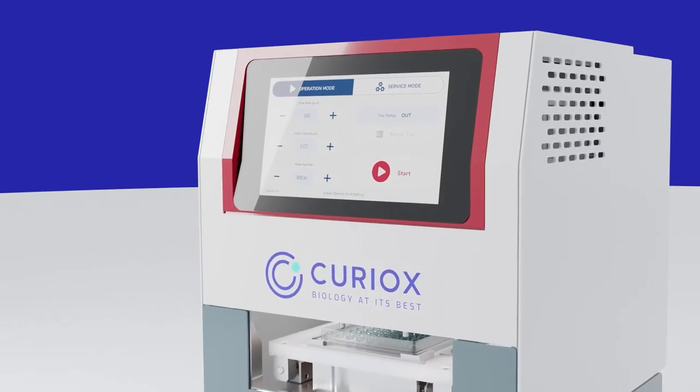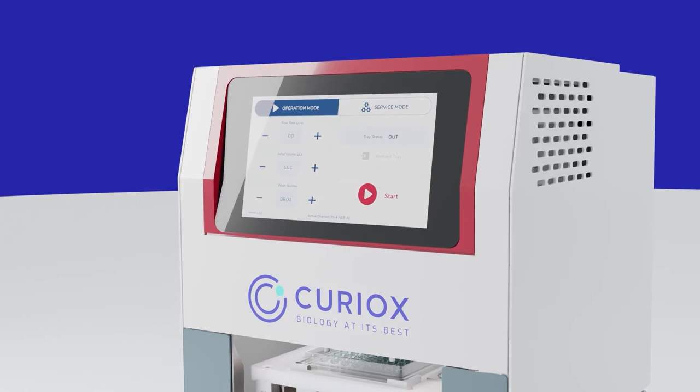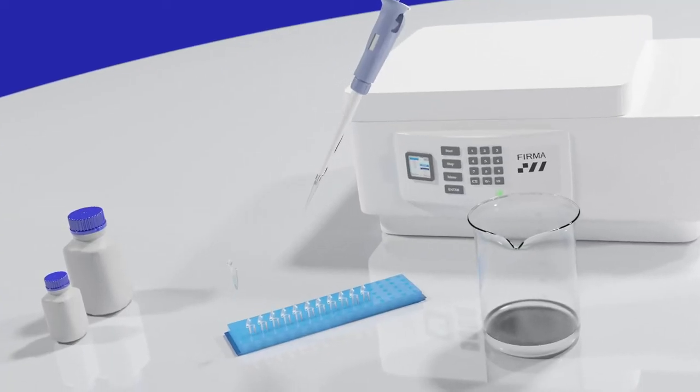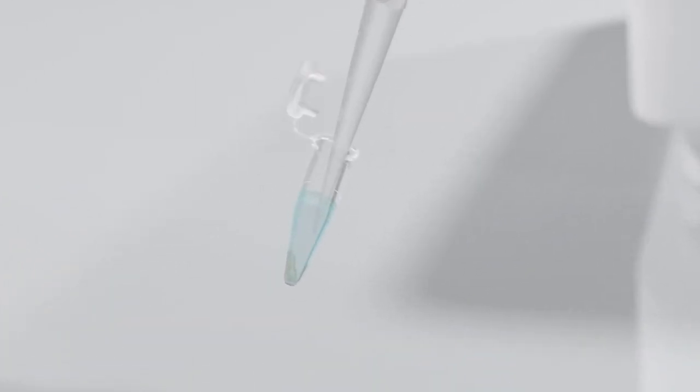All it takes is the press of a button on the laminar wash system, instead of the multiple manual steps associated with centrifugation, including spinning, sample aspiration, buffer dispensing, and resuspension, all repeated for every wash step.